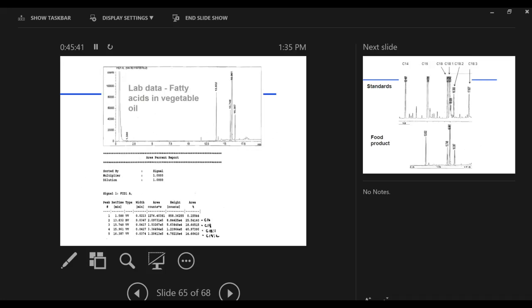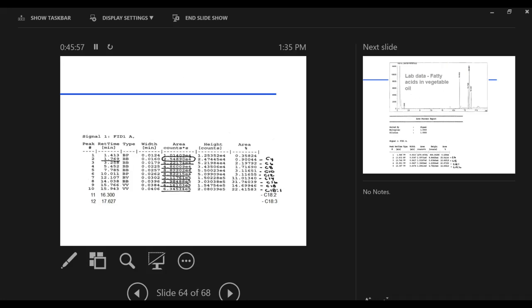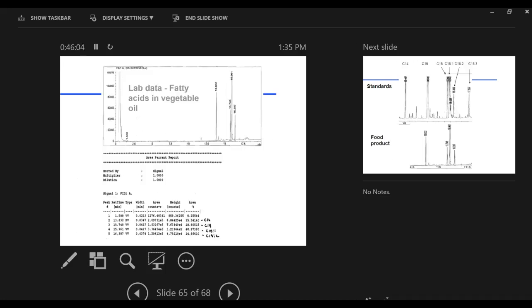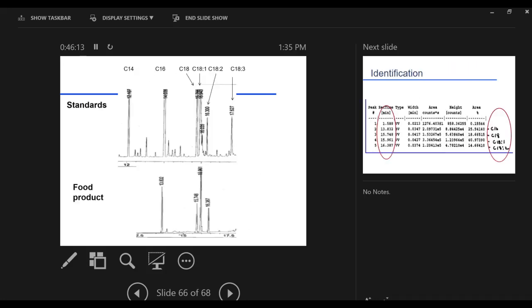This is a vegetable oil. Vegetable oil. It's got a little bit of C14, a little bit of C16, palmitic acid. But again, here, your C18 saturated, monounsaturated. Same thing. So this one back here could be a milk sample. Dairy has short-chain fatty acids. This would be more characteristic of vegetable fat. Really no short-chain fatty acids in your vegetable fats. They're all C16, really, and C18. So different amounts. And this is kind of that area expanded a little bit to see a little better where these peaks are. The C18s, it's hard to separate just one double bond. So C18, stearic acid, no double bonds. Oleic acid, one double bond. And so that's stearic acid, no double bonds. That's with one double bond. That's two double bonds and three double bonds.